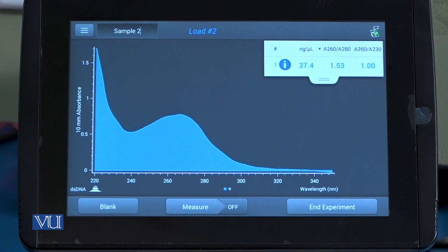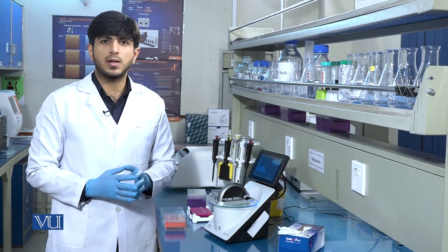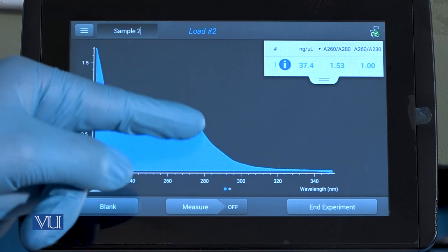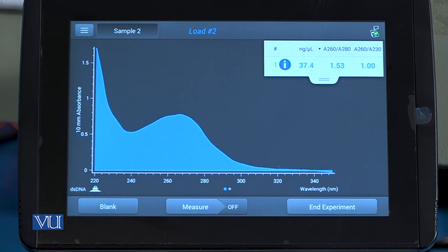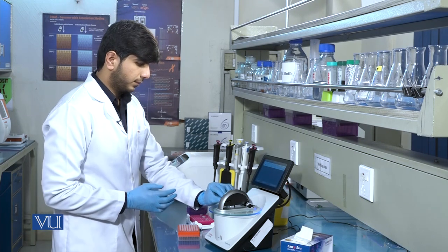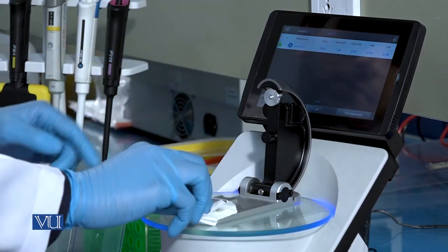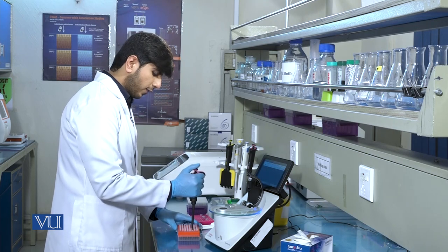This graph also tells us the purity of the DNA. It should be remembered that nucleic acids give maximum absorbance at 260 nanometers. So there will be a peak near 260 nanometers, which will show the presence and tell us the concentration of DNA. Likewise, we can also run the second sample to check the DNA concentration. Again, we will clean the tips and add 1 microliter of DNA sample.